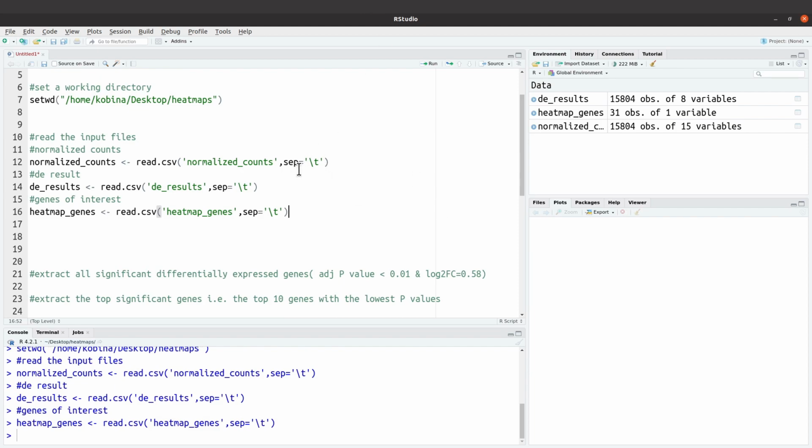Now, ideally, if you have data sets like this, you can explore. But the focus of this tutorial is to generate a heat map. So I'll do just a little exploration where it's necessary. So take note of that. Let's just do a quick one before we proceed. So you can check for the column names. You can check some of the entries.